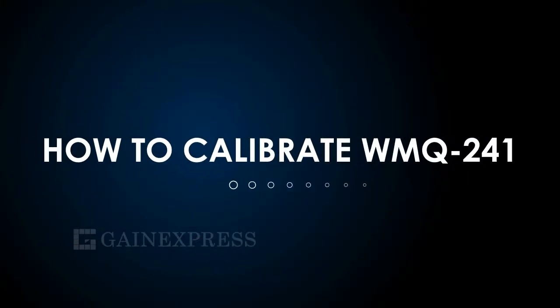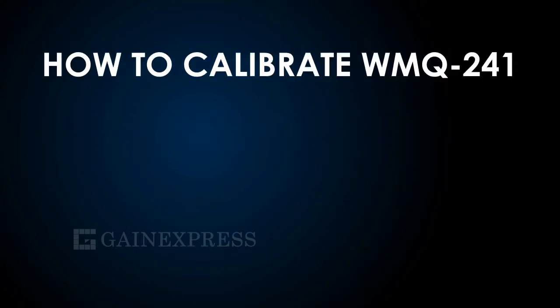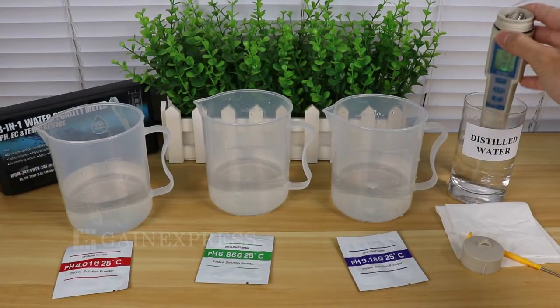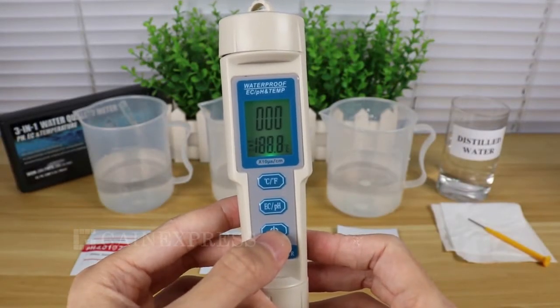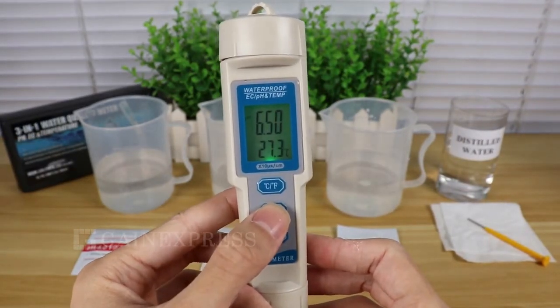Here is how to calibrate the WQM 241. First, rinse the electrode with distilled water and dry it with clean tissue. Turn on the meter and select the pH unit by pressing the EC/pH button.